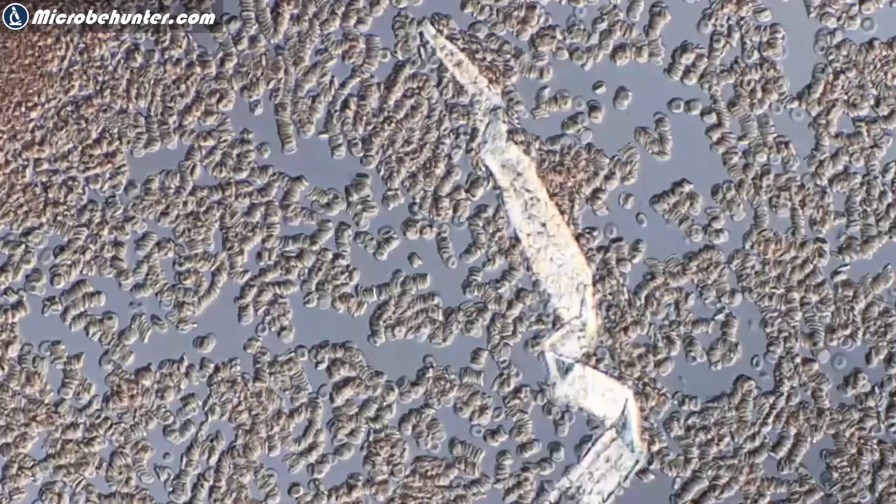For example, dust and dirt is sometimes interpreted as being something meaningful, but the slide was simply not cleaned. Or things are interpreted as being bacteria, moving bacteria. No, but this is some kind of cell fragments that are moving because of Brownian motion, but these are not bacteria.